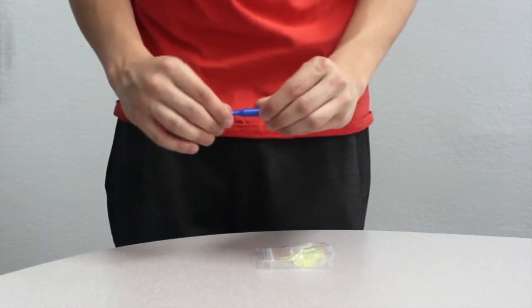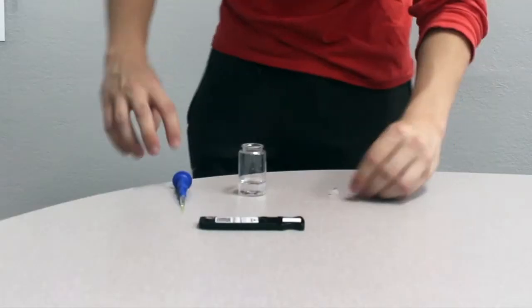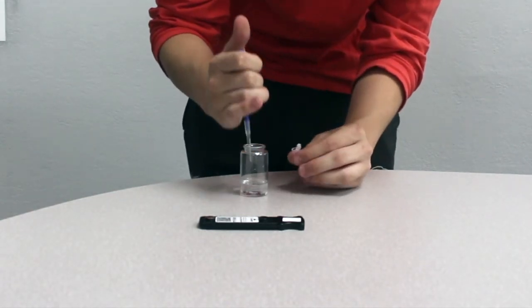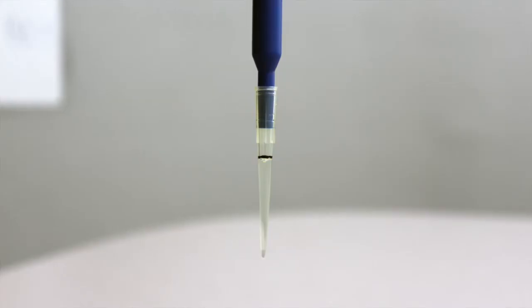Next, firmly attach your pipette tip to the 100 microliter fixed pipetter. Next, carefully uncap your reagent tube. Ensure that the pellet has fallen to the bottom of the tube before uncapping. Using your pipetter, transfer 100 microliters of your sample into the reagent tube.